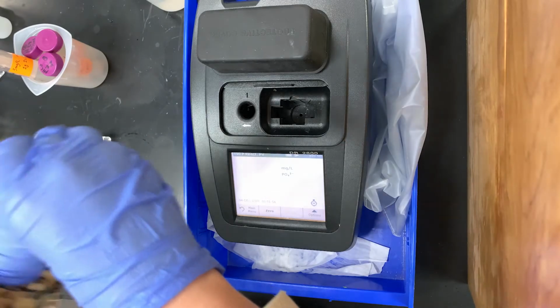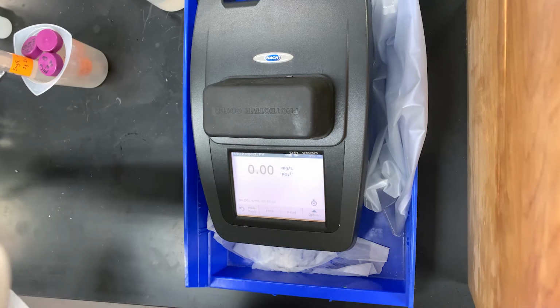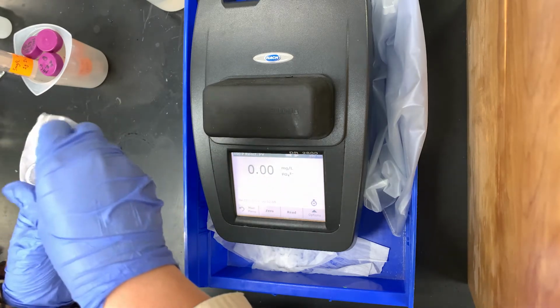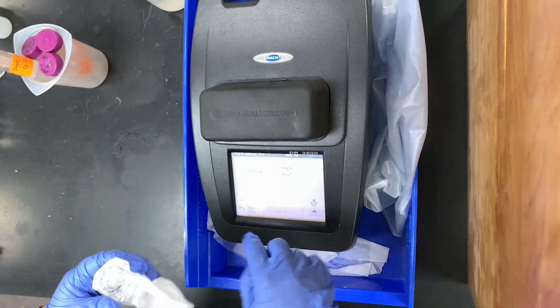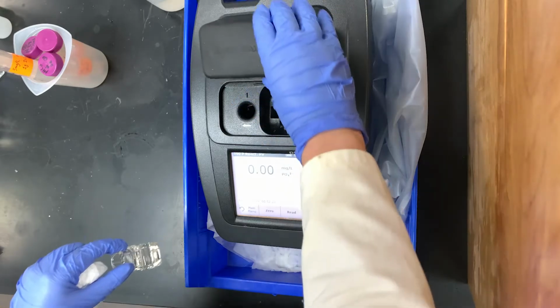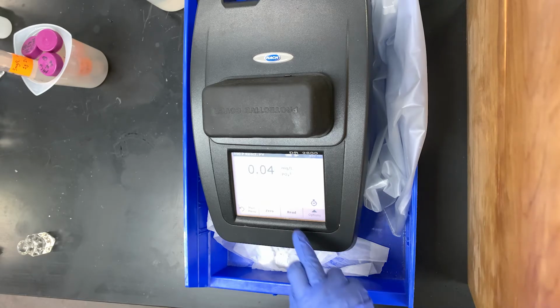Alright, so it's been 2 minutes. I will put our blank in the spectrophotometer, which again is just 10 mils of sample with no reagent. We will zero that, and then we'll put our standard in. So for our 2 milligram per liter initial phosphate solution, we have a final concentration of about 0.04 milligrams per liter.